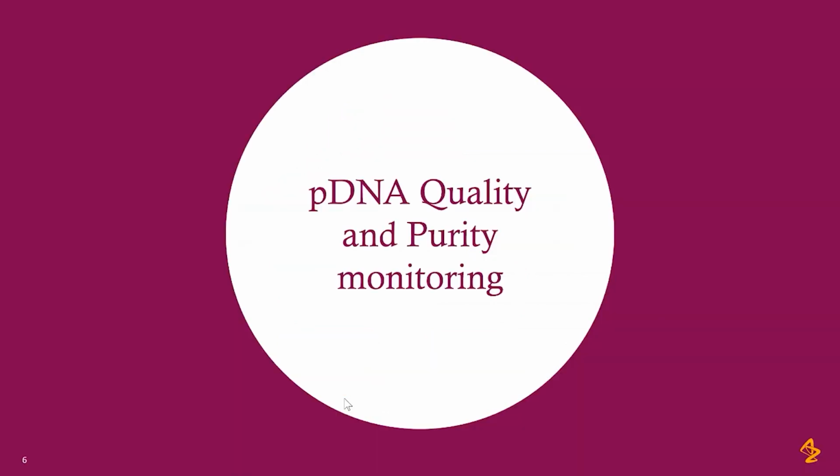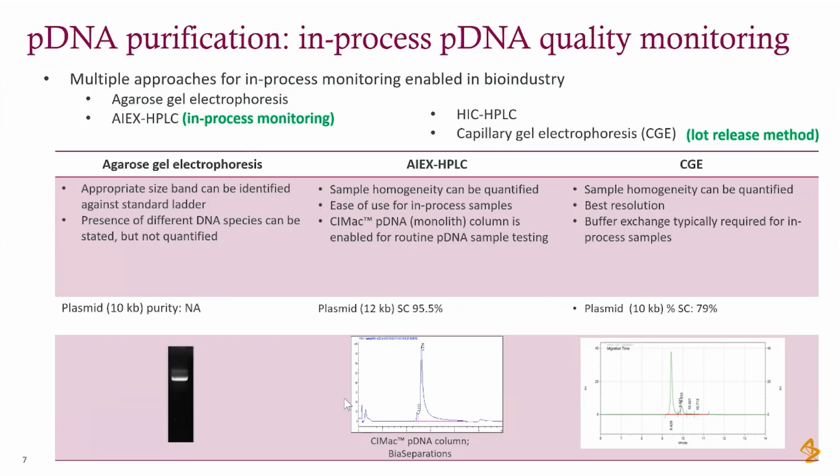So, in order to develop this type of process, we have to have plasmid DNA quality and purity monitoring tools. And for that, we have mainly three analytical tools enabled in AstraZeneca. We use agarose gels. Well, this technique is, I would say, quite aged.